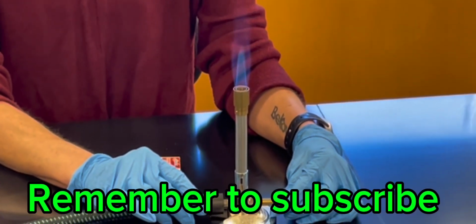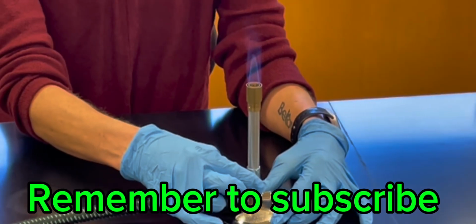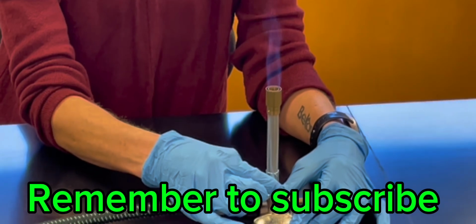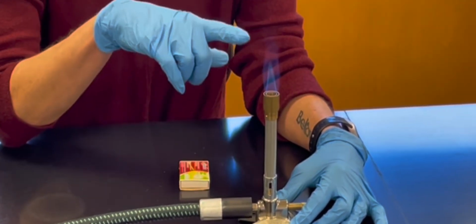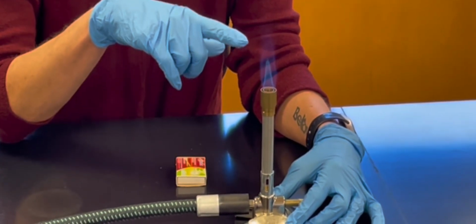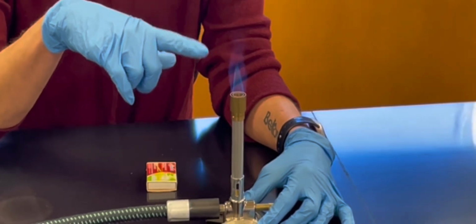Once you have a flame, this knob will control the height of your flame. You don't need it so high, you don't want to take your eyebrows off. And then by turning this dial, you can control the color of your flame. What we want is a blue flame with a tight inner blue cone. It's the tip of that tight inner blue cone that's the hottest part of the flame, and that's what we're going to use for sterilization.